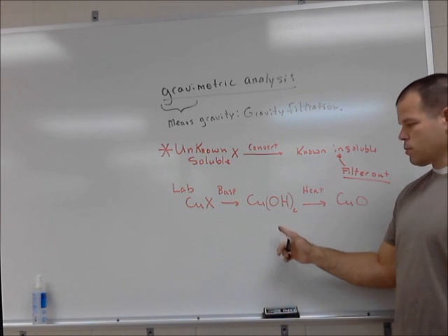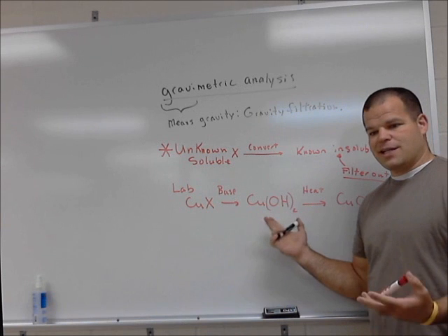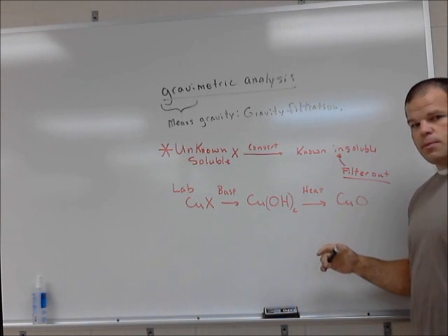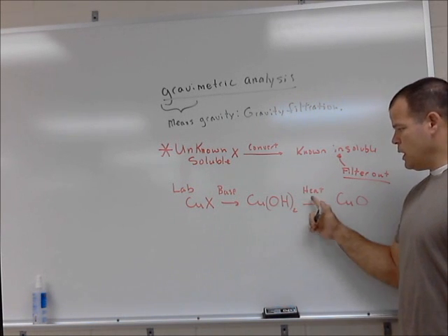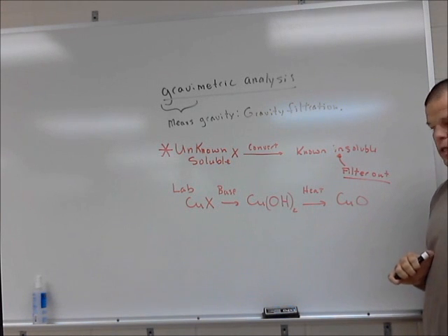This is a dark blue slushy chemical, but is not very easily handled and is kind of sensitive. It oxidizes easily. So we'll just go ahead and let it oxidize with some heat to speed it up. If you get to this point in the lab and you're running out of time, it will oxidize overnight if you just leave it sit on its own. Heat will be a way of speeding it up to form copper oxide.